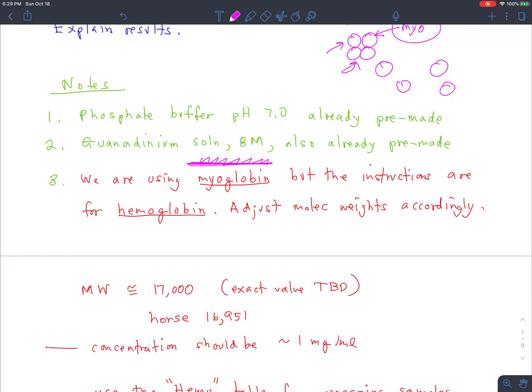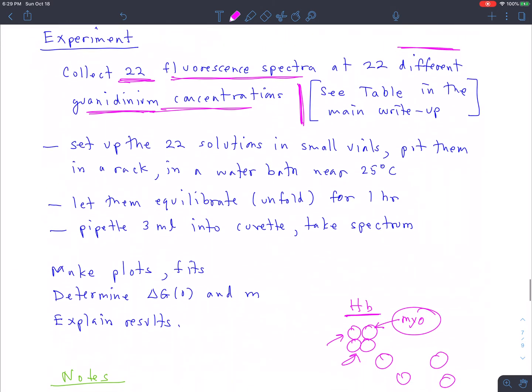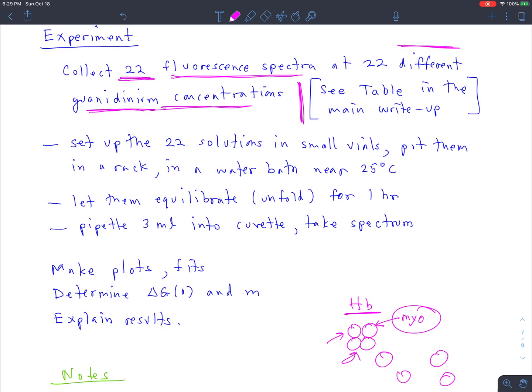All right, so what we're going to do is set up these 22 samples, each at a different guanidinium concentration. We're going to put them in a water rack at 25 degrees, and we're going to let them sit for an hour. Why? Because it takes that long for the unfolding process to occur.